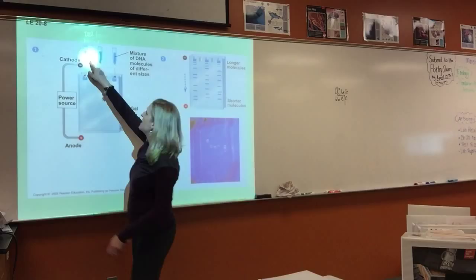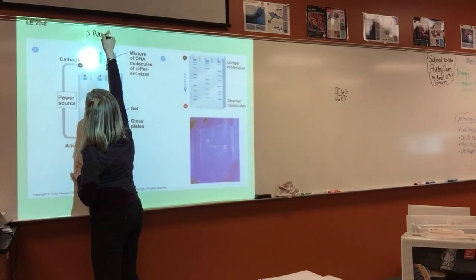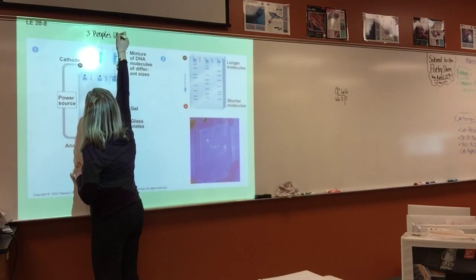So then let's look at these 3 micro test tubes. Let's say that these are 3 different people's DNA.